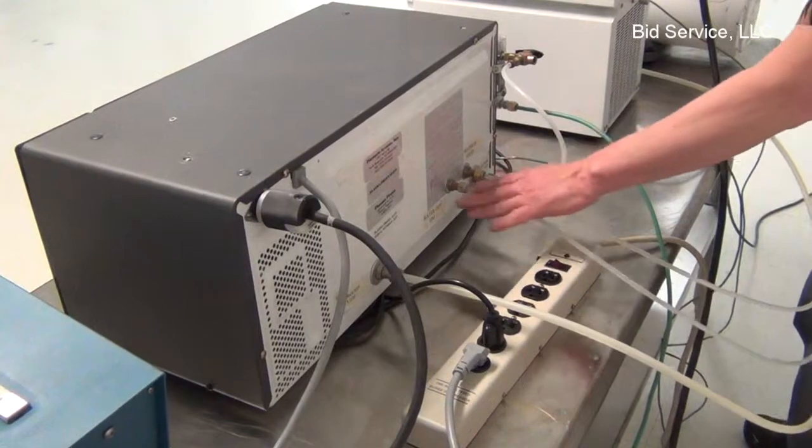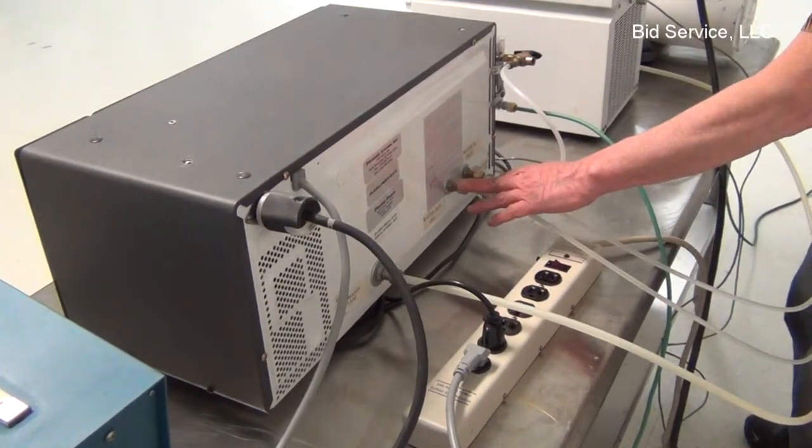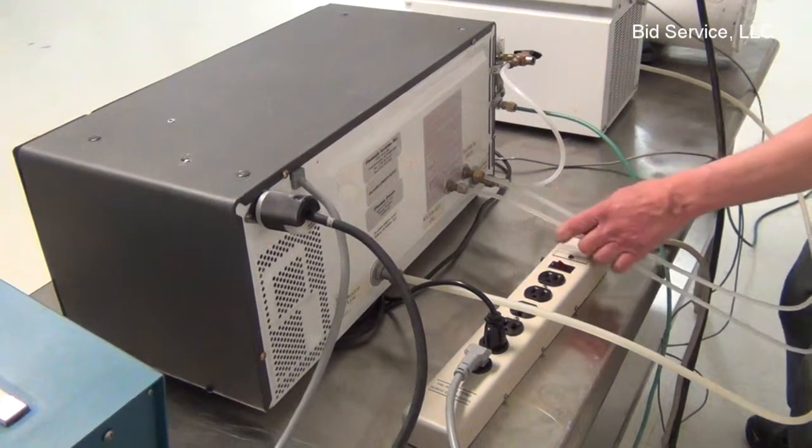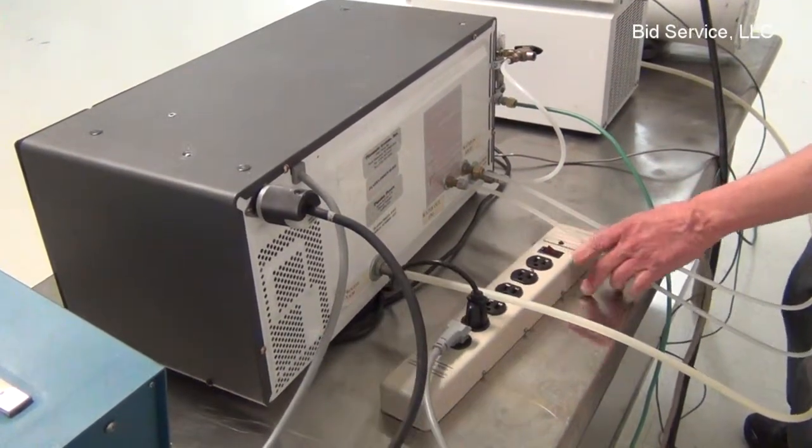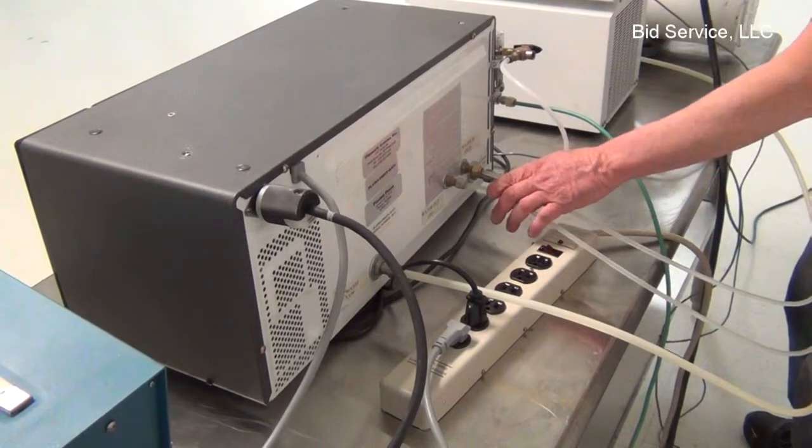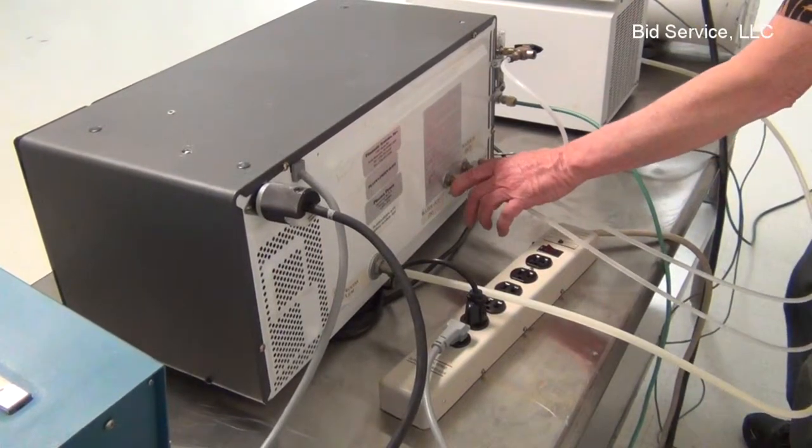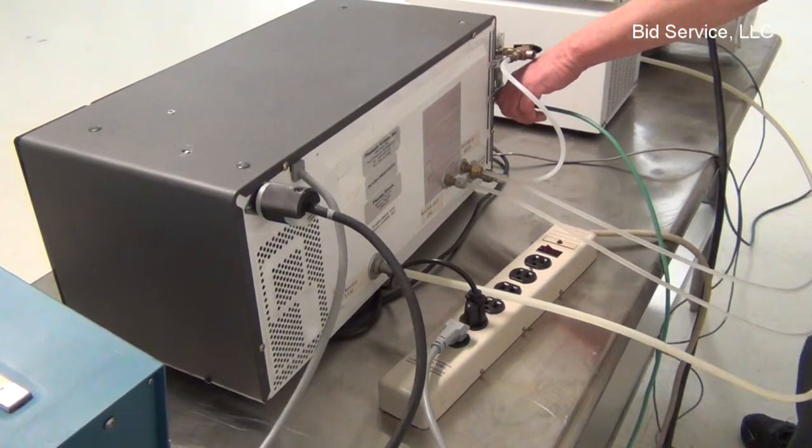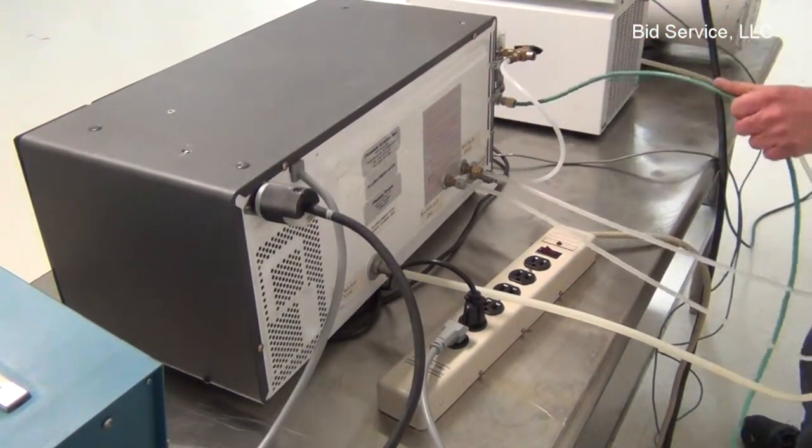It has a water-cooled jacket that is inside, so we also have cooling water as well. This can be ambient water, such as your house or facility water, but normally around 20 degrees C is sufficient. And of course, we have a connection to our inert gas that we're using. In this case, we are using argon.